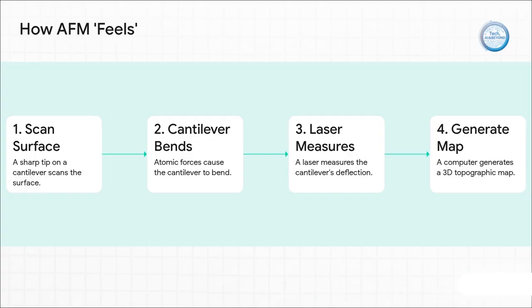Seeing individual atoms? That's just incredible. So we've talked about microscopes that use a sense of sight. But this next one, atomic force microscopy, or AFM, sounds totally different.